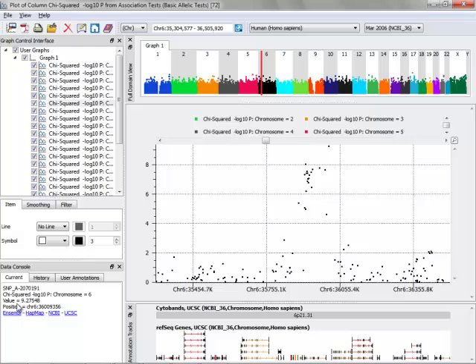In the data console here, it shows me the value for that particular SNP, as well as the chromosomal position, the SNP identifier as designated in the Affymetrix annotation track. I can also look up that region in another database by clicking one of the hyperlinks here.